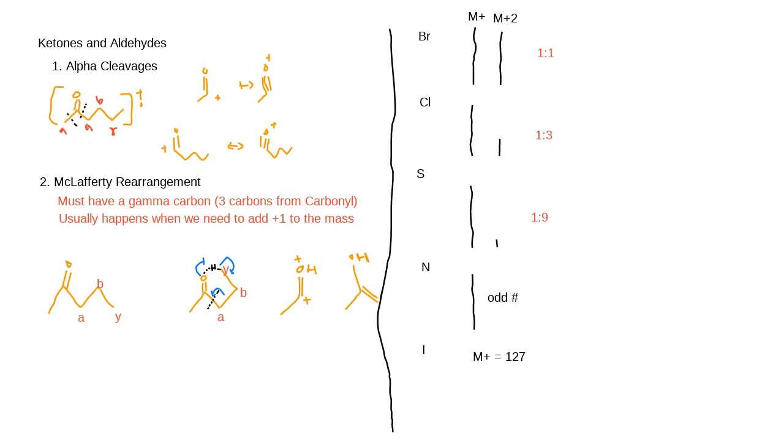And then giving you different examples of how to cleave it and different ways you can cleave it, and like the notation of it and how to find, how to subtract, and how to get the results you want, the difference between carbocation and radicals, what M plus means, what m over z means, the abundances of the fragments on the graph.